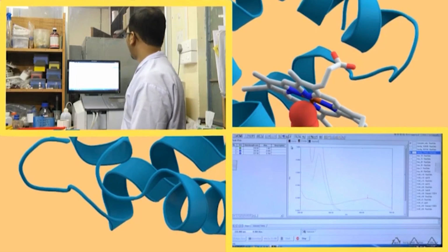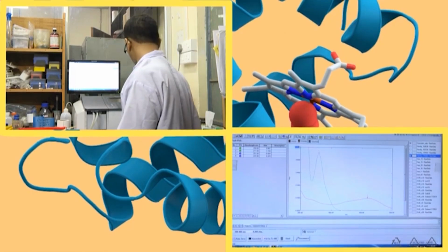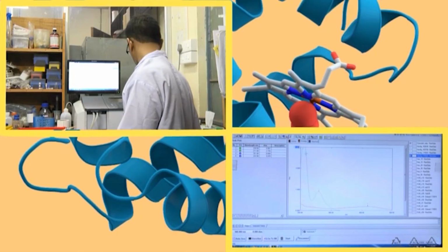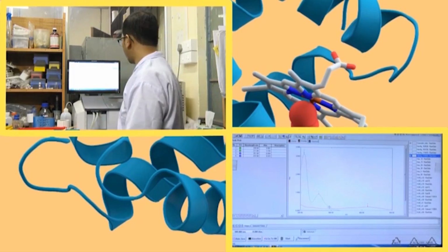It is just below 1. And this peak is around 3.0, 3.5. So, here we can see generally two peaks arise.